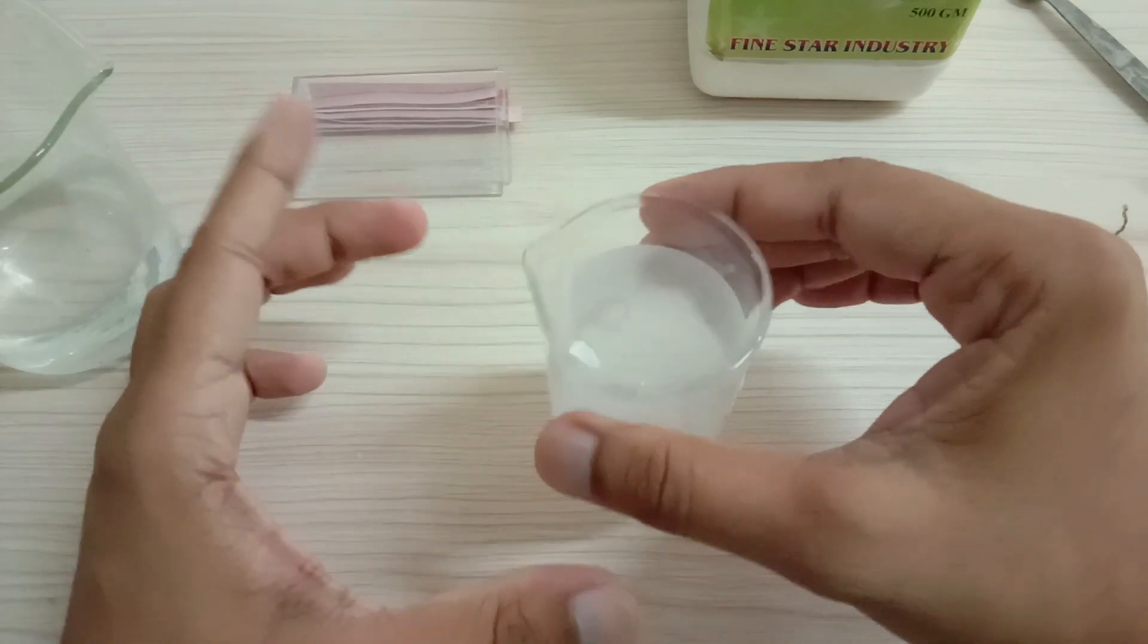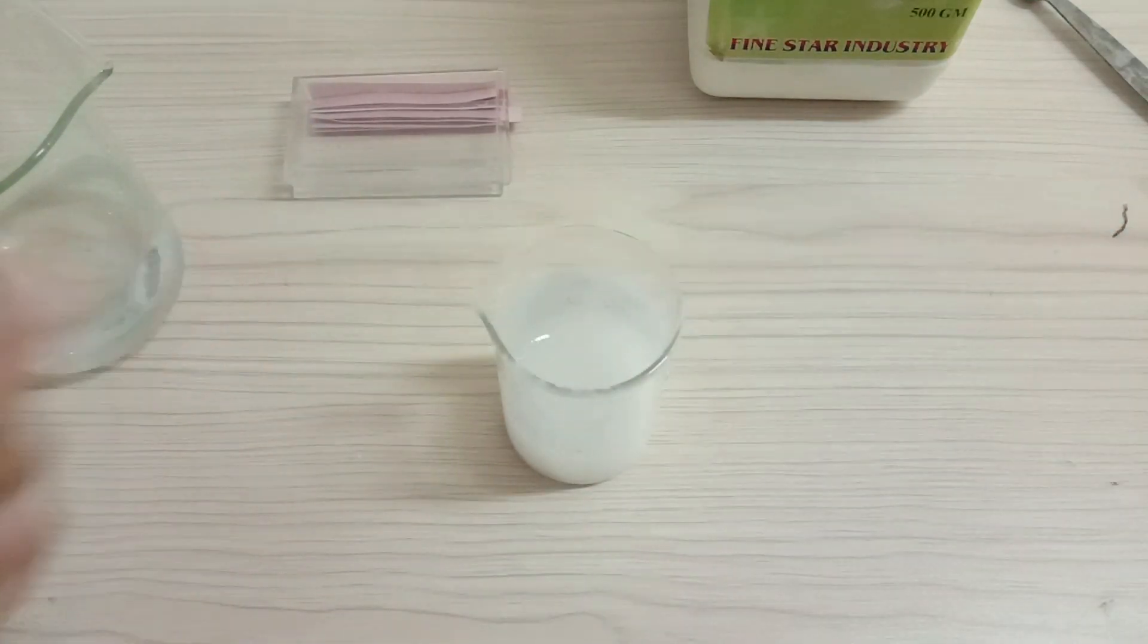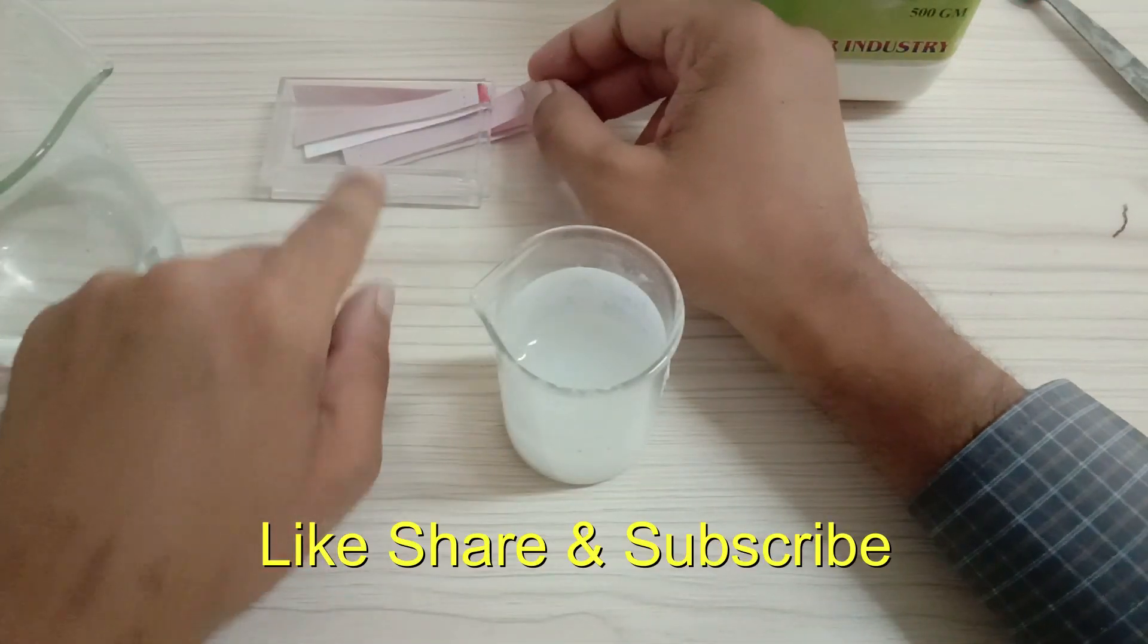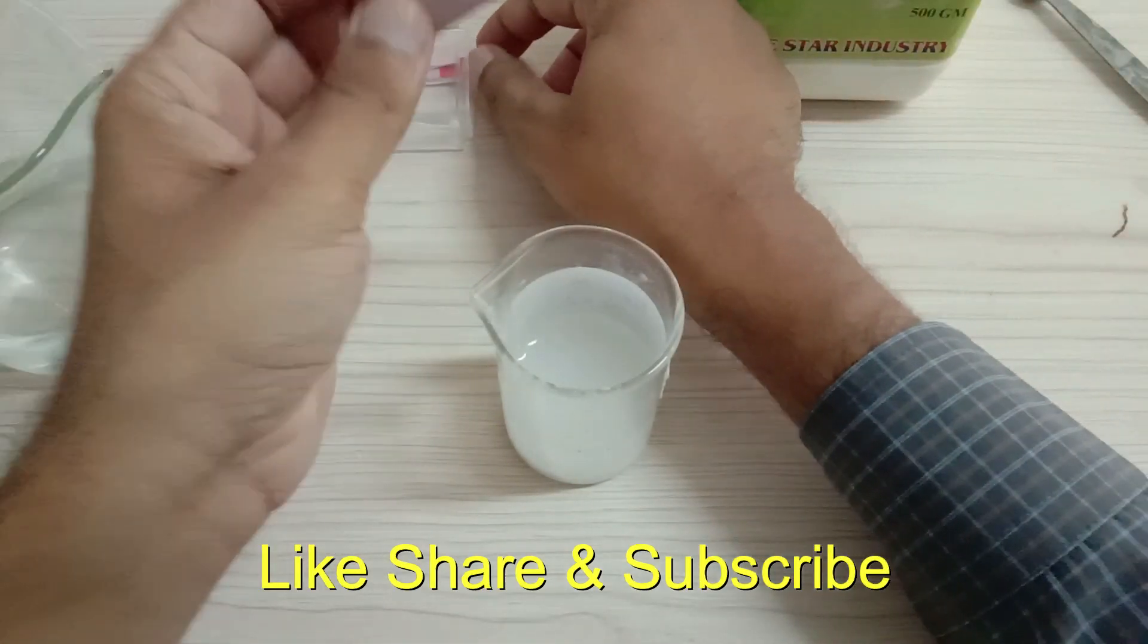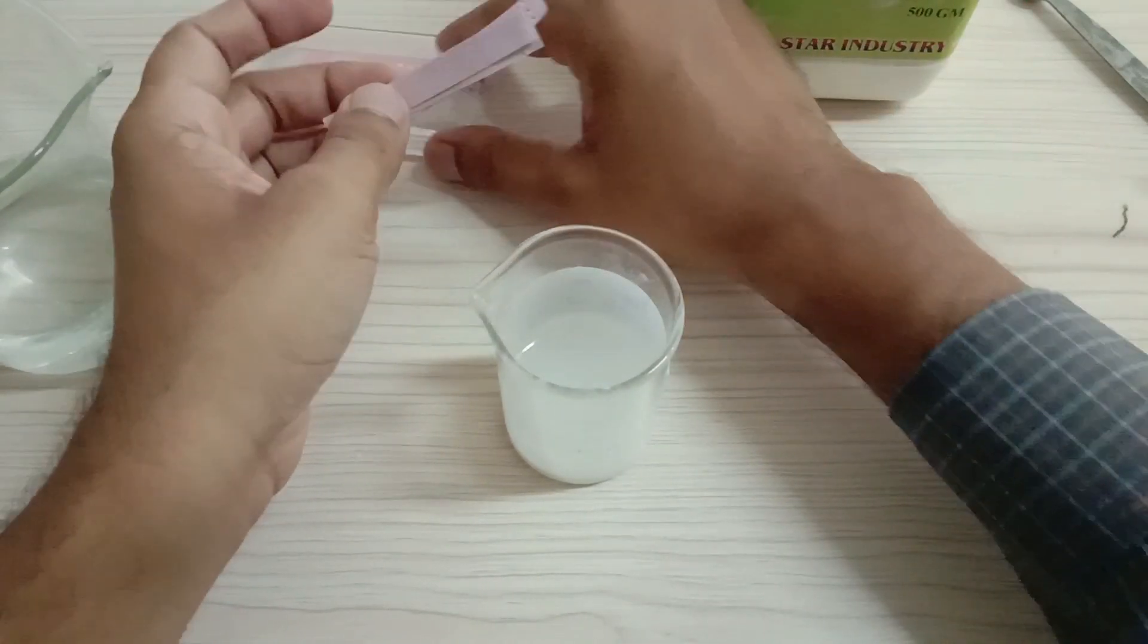Now I will wait because calcium oxide is not fully soluble in water and it takes time to dissolve. But meanwhile, what I can show you is this red litmus paper, which is used to check the presence of the base.